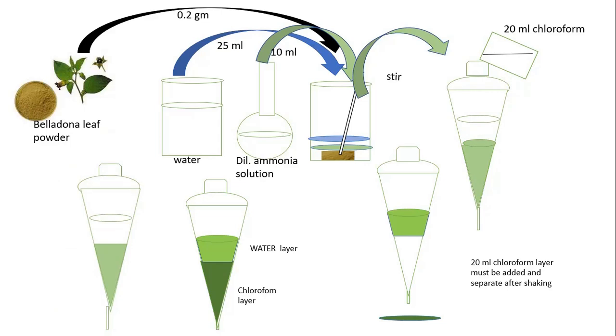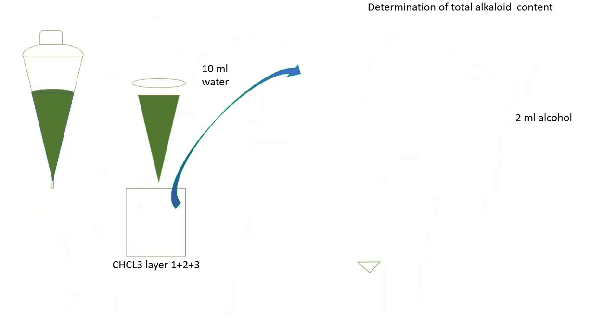The alkaloids come into the chloroform from the water. Next, separate the chloroform layer into a beaker. Three times, you have to add fresh chloroform into the same aqueous layer which is present in the separating funnel. Again, shake it and separate the chloroform layer. You are getting the chloroform layer. Combine all the chloroform layers which contain your alkaloids.